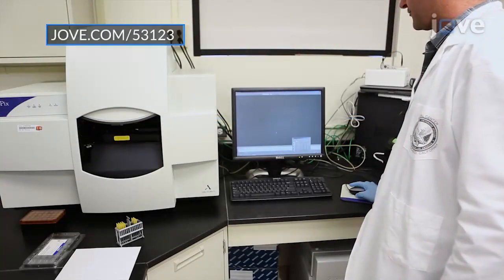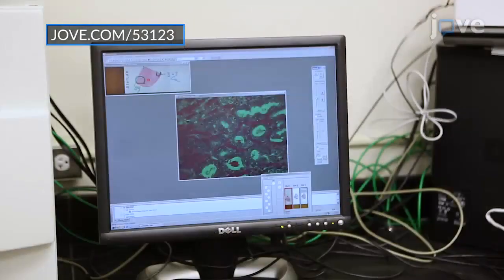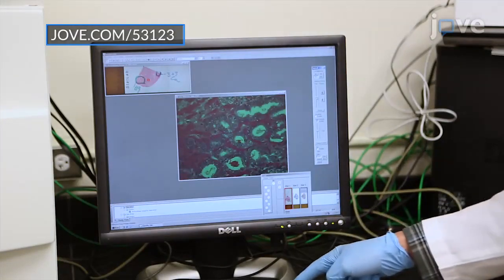After performing microdissection of tissues as previously done, proceed to isolating serum-derived EVs.